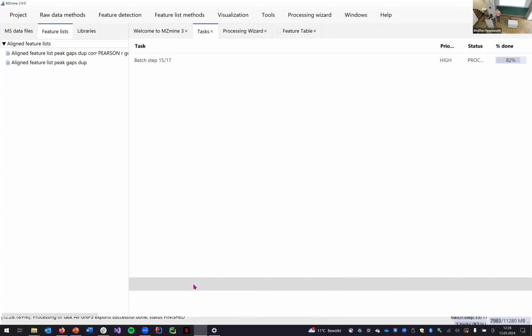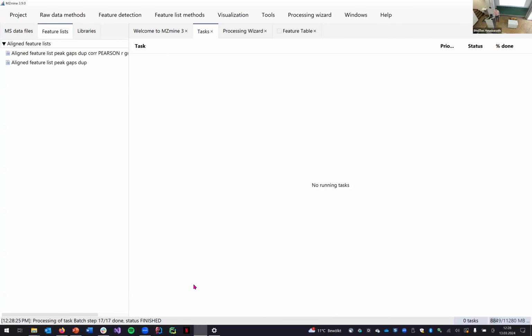As it's meant to be used by a pro, a really expert in XCMS or an expert in MSDial. So if I did a comparison, it would have the best MZmine results, but the worst MSDial and XCMS results. But that's not because the softwares are bad, but because I'm not used to these softwares. So if you as an unbiased user want to do a comparison of the softwares, I think that's the better way to do it.